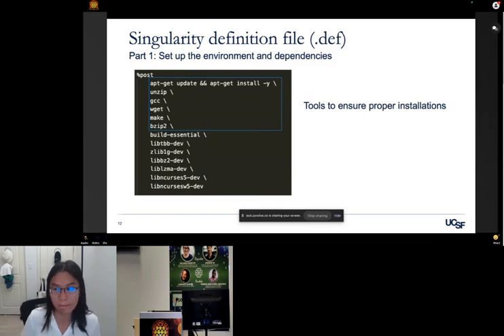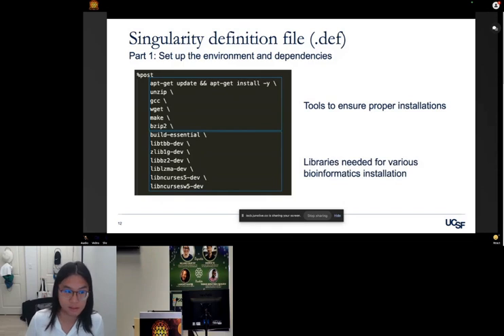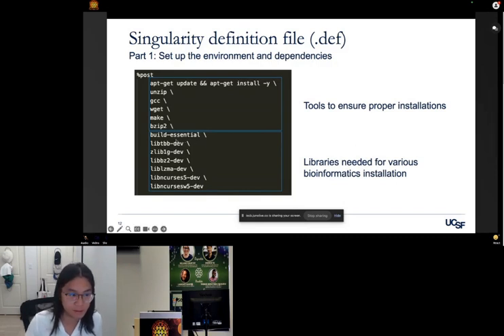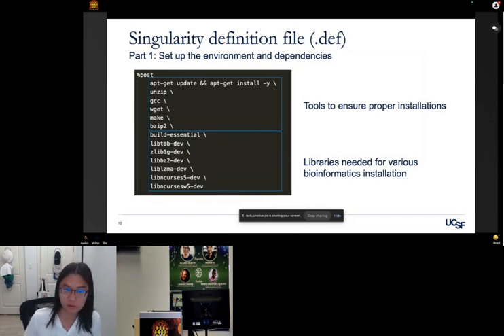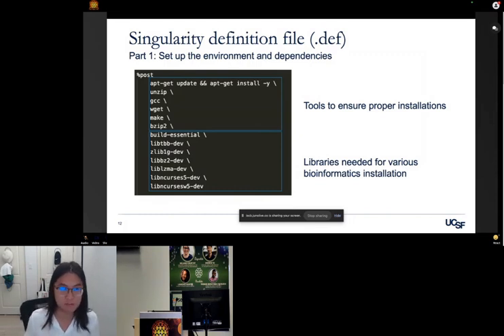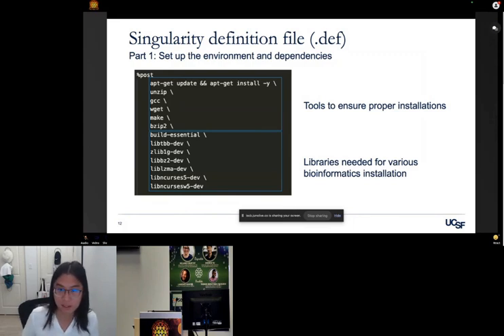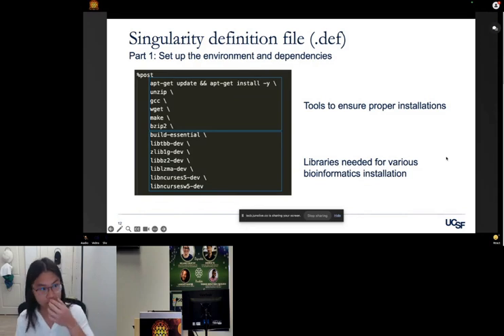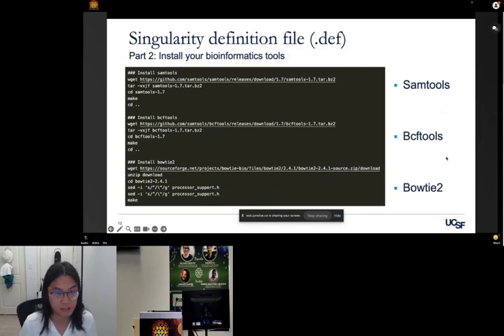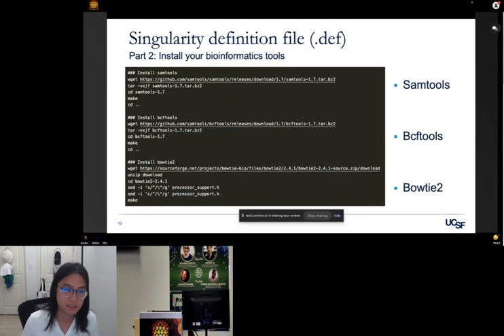The first part sets up the environment and dependencies — installing tools like wget, make, and unzip to ensure proper installation of bioinformatics tools. You also install system libraries needed for bioinformatics tools; in this case, libtbb-dev is needed for Bowtie. These are things to take care of before publishing your tool so users don't need to install all these packages themselves. The second part is where you actually get the tool, extract it, and build it.